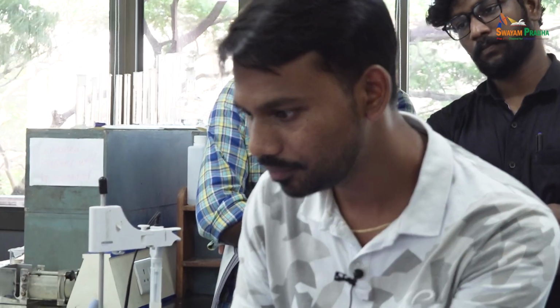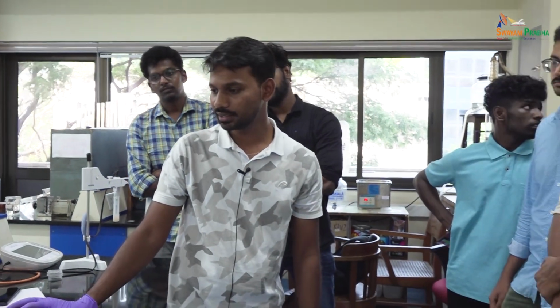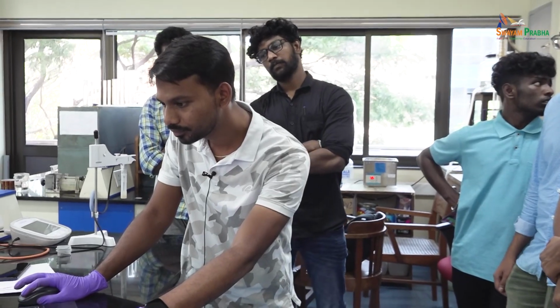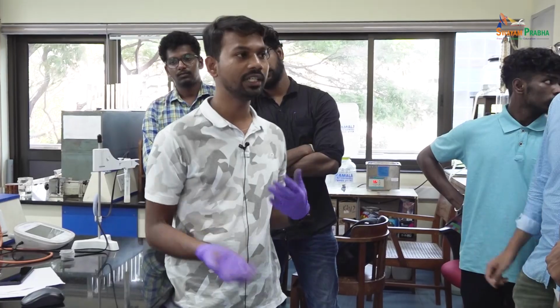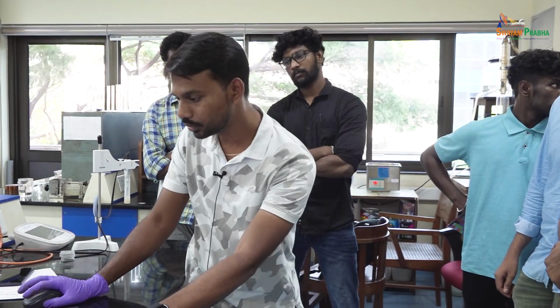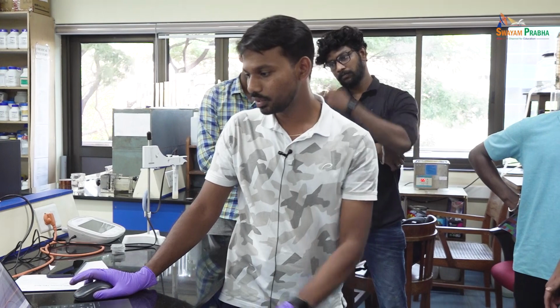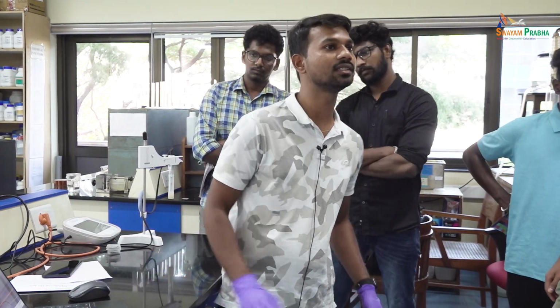In Origin there is an option called screen reader. You can select that one and you will get a window like this. It will be easy to find out the ECOR and ICOR values in Origin. You can directly go to the intersection point and click on it, and it will give you the x and y values. The y value, which is ECOR, is minus 56 millivolts.